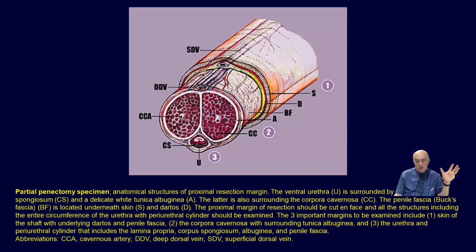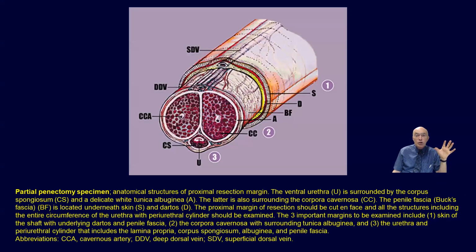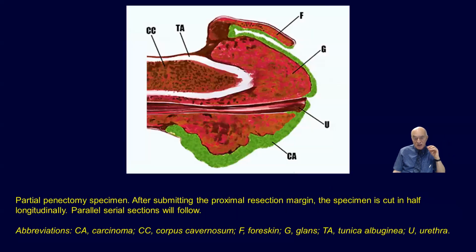Now, passing to the penile pathology, this is also a very nice cartoon provided by the CAP protocol, in which you can see the different anatomical layers of the penile organ, starting with the most superficial ones in the skin and going into the deeper ones, with the dartos, corpora cavernosa, etc., that are going to be used as a reference for the depth of invasion of these tumors.